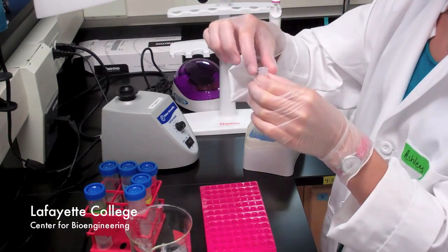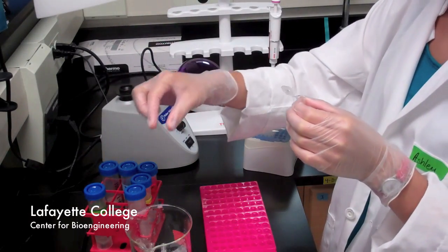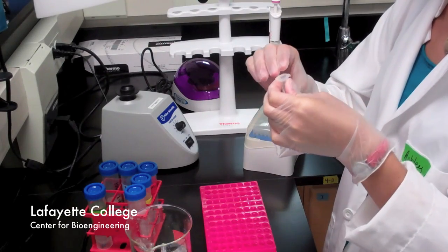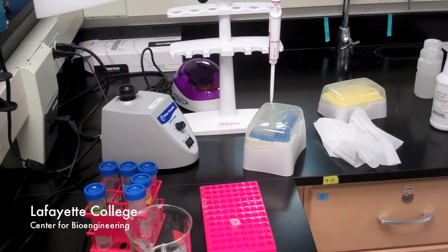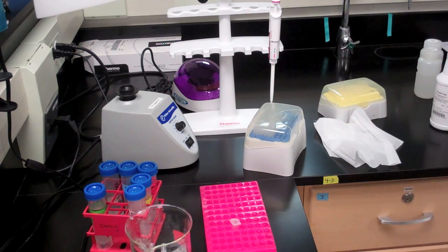Now, discard the spin column and not the collection tube. The RNA sample was eluted with the water. To learn how to quantify RNA, please watch the next series of videos about how to use the nanodrop spectrophotometer.